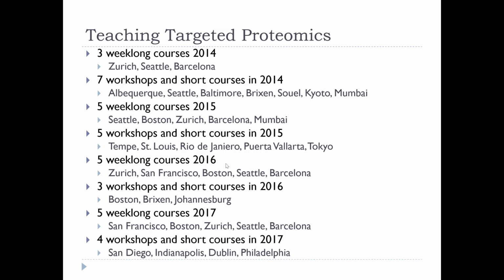And so starting in 2013, the Aebersold lab, I'd like to thank Ruedi Aebersold, has been a big proponent both of technology. He doesn't come from an informatics background, but he's funded a lot of informatics, starting with the Trans-Proteomic Pipeline, for which he did a course, and then once he got into SRM and targeted quant, his group was the first group to do a course of this type in 2013. Olga Vitek and I both, and Mina, all joined that course, and then all of this other stuff has grown out of that.